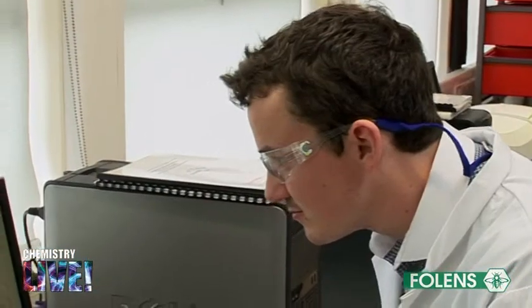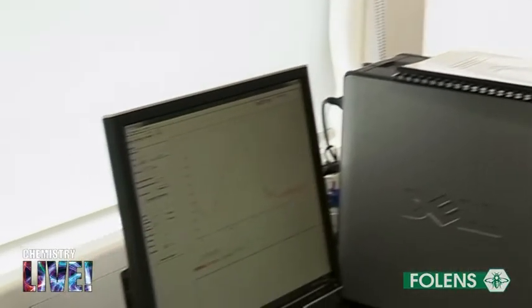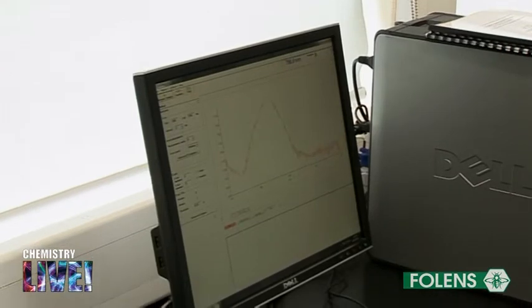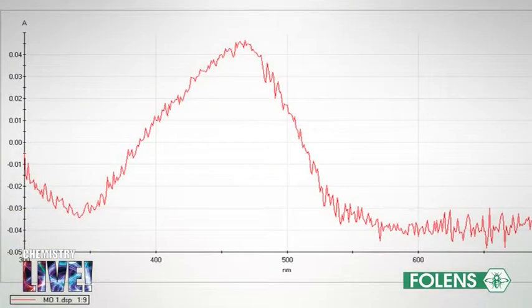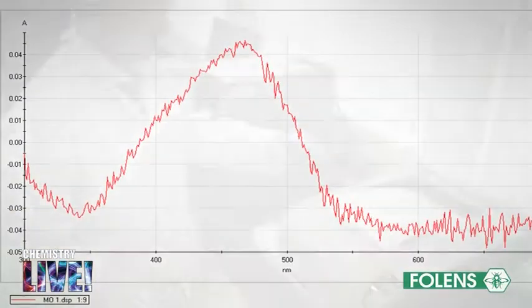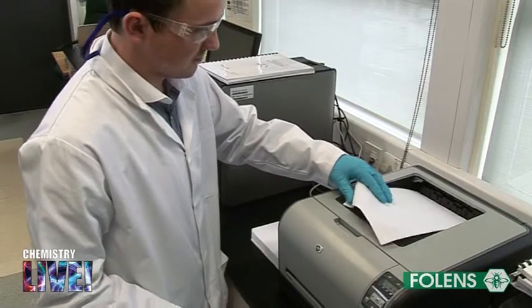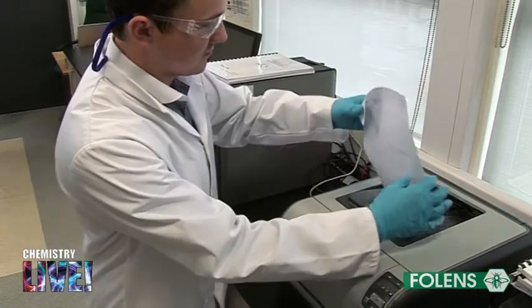A UV absorption spectrum is obtained as shown on the computer screen. A printed copy of the UV spectrum may also be obtained.